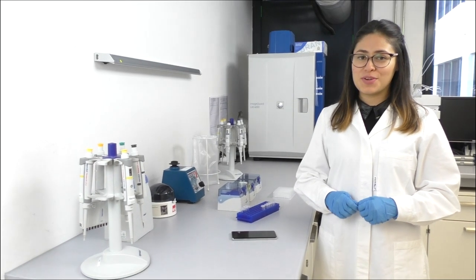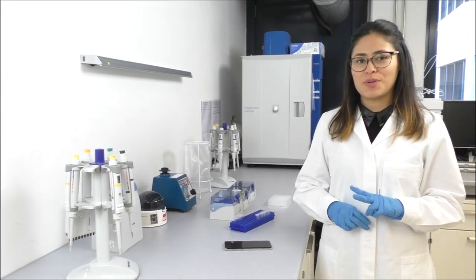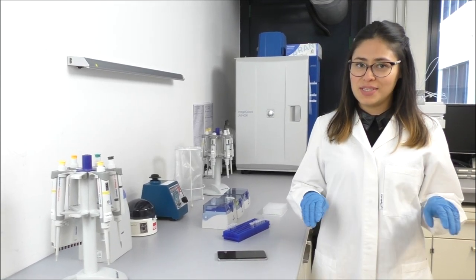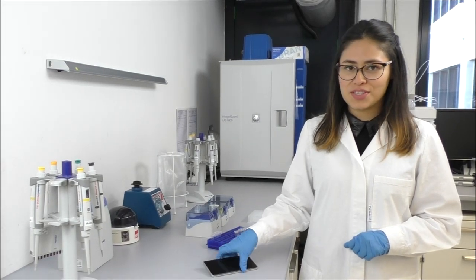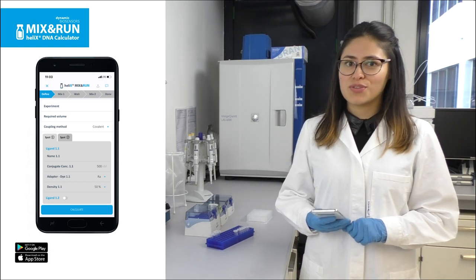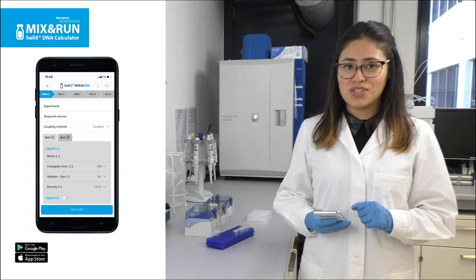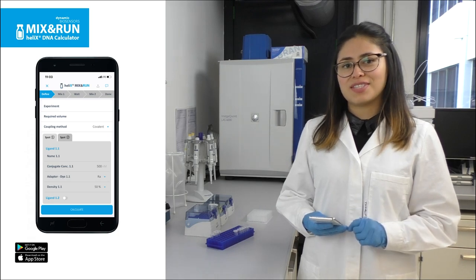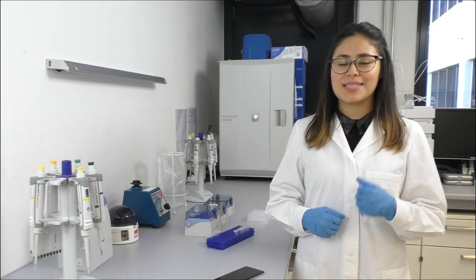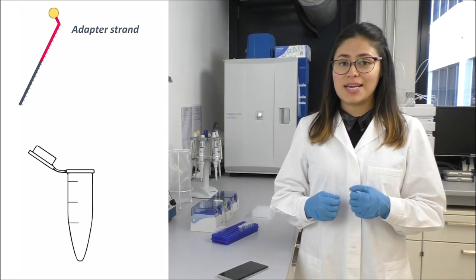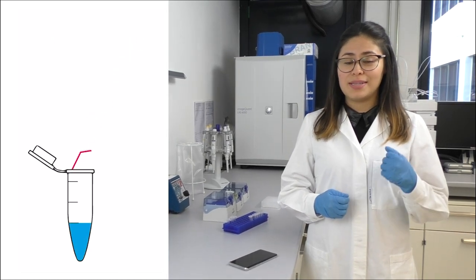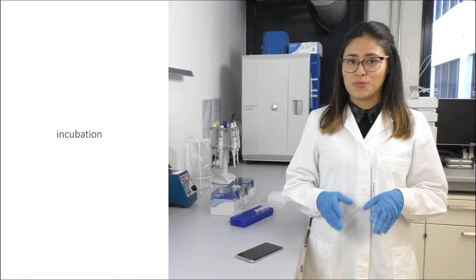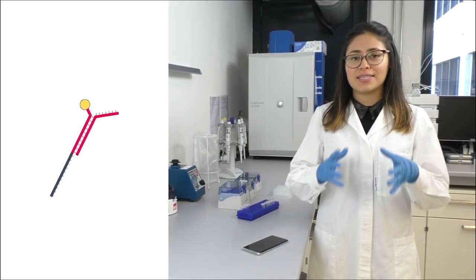Okay, now let's prepare our samples. Two types of samples have to be prepared: the ligand molecules for immobilization on the chip, and a dilution series of our analyte molecules. We can calculate the required volumes and concentrations using the free Dynamic Biosensors Mix and Run app, which guide us through the process step by step and suggest conditions to ensure complete and efficient hybridization. First, we are going to mix the adapter and the ligand strand so they can pre-hybridize before the biosensing experiment. After mixing, we are going to incubate the adapter and the ligand strand for a couple of minutes so they have enough time to pre-hybridize and form a duplex.